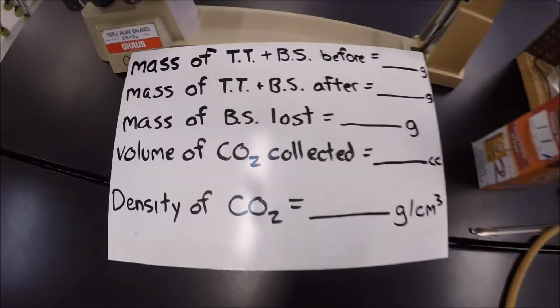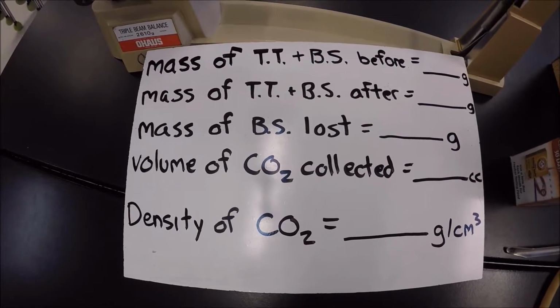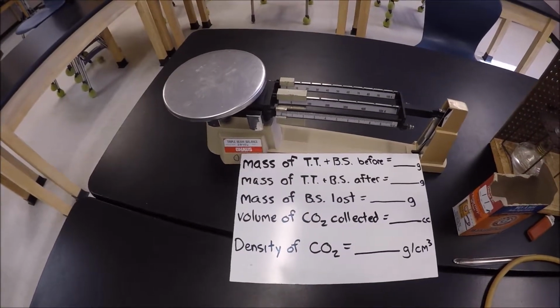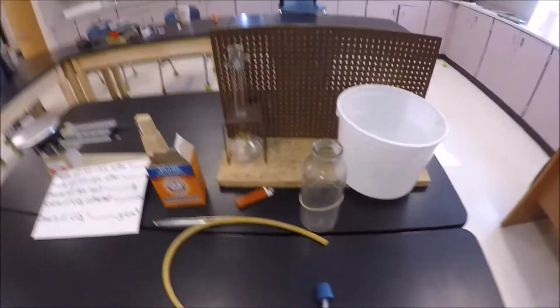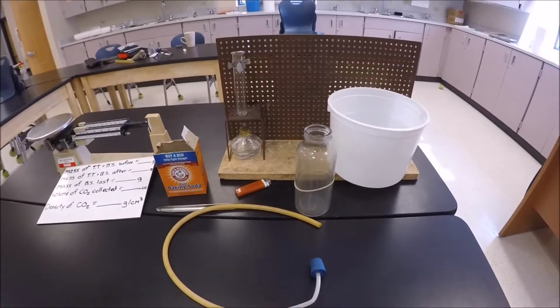I've got what could be in your science notebook, but I did this on a little whiteboard. Some basic calculations here, a little data sheet, if you will, and then we have a triple beam balance. So essentially what we're going to do today is we are going to heat up some baking soda. And so you're going to watch as we go through and look at this here.